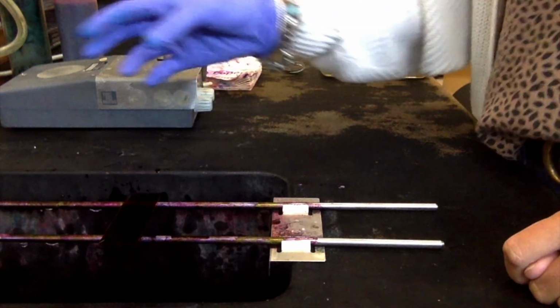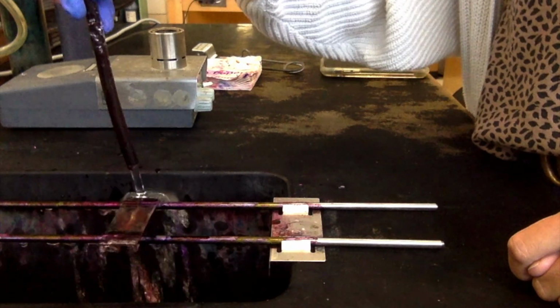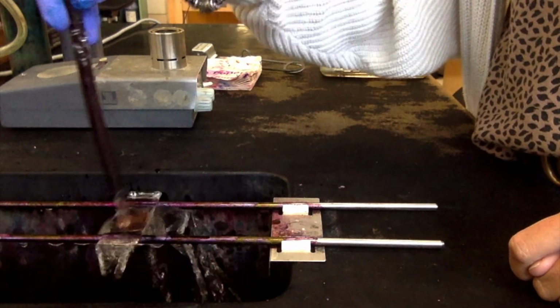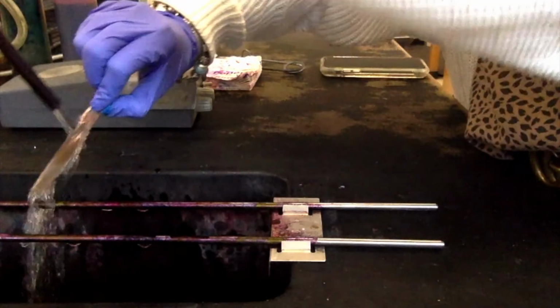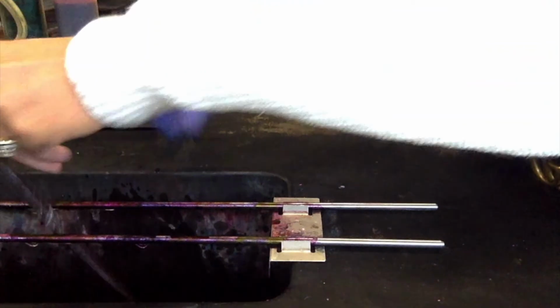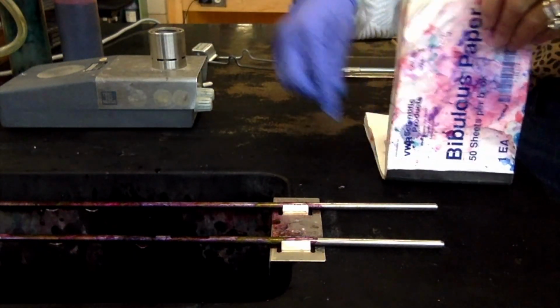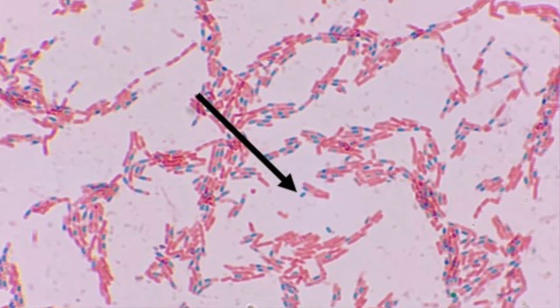So it's been about a minute, so we're going to go ahead and rinse our safranin off. We'll rinse the bottom too, because we want to make sure that we've got all that stain off of there. And now we are going to blot it dry with the bibulous paper, and then we'll look at it on the microscope. And here is our spore stain under the microscope at 100x with the oil immersion.